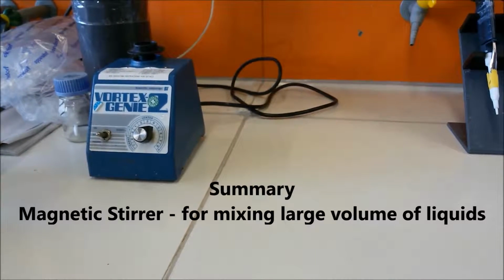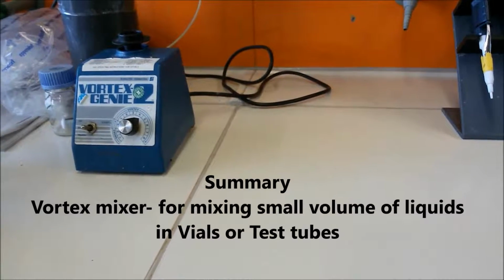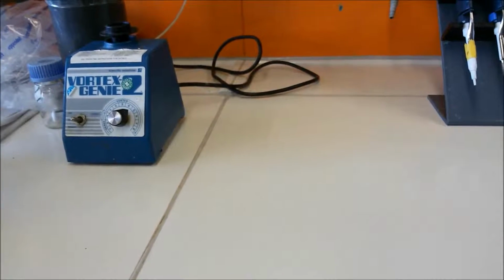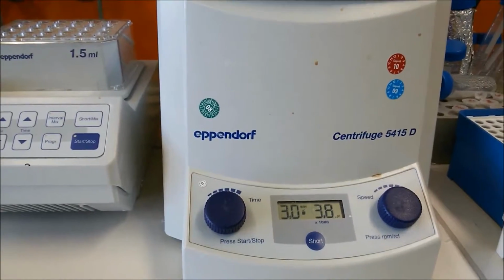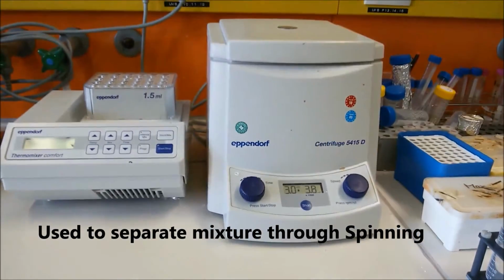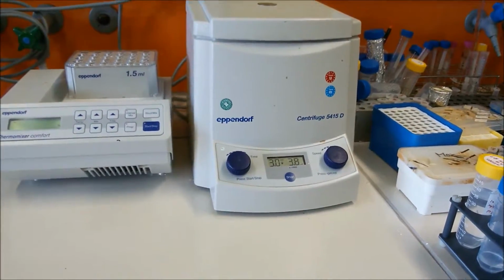So now these are the lab instruments. The magnetic stirrer is a basic lab instrument, and this Vortex mixer is another instrument. Now we will talk about the third instrument, which we call the centrifuge. Centrifuges can be of different types. Right now we are talking about this one, which is kept here. These kinds of centrifuges are called tabletop centrifuges.